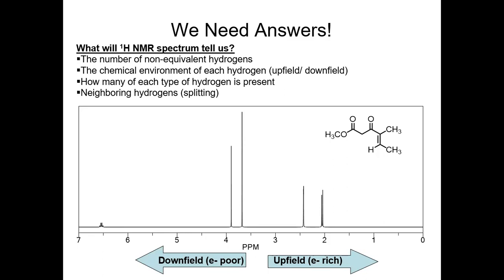So there are different types of NMR that you can do. The magnet that we have, you can do proton, fluorine, phosphorus, and carbon, those 4 nuclei. But really, at this point, you can study many different nuclei by NMR, because the technology is so far advanced than what it used to be.